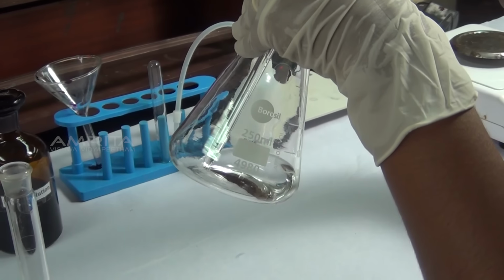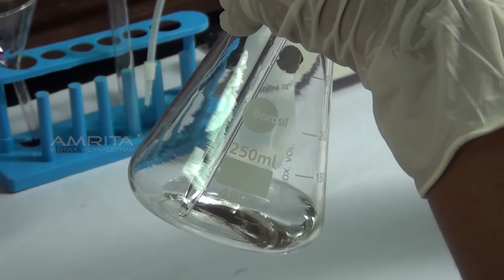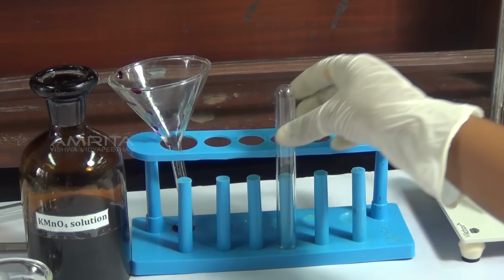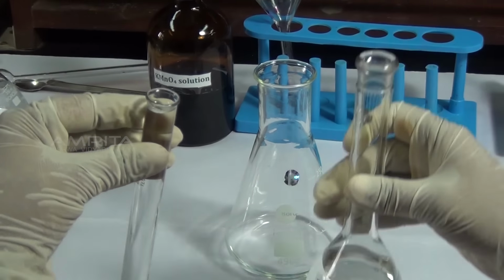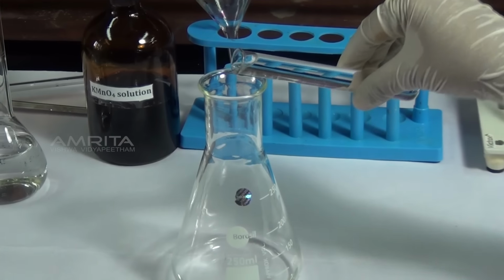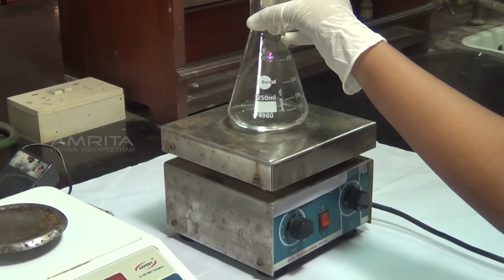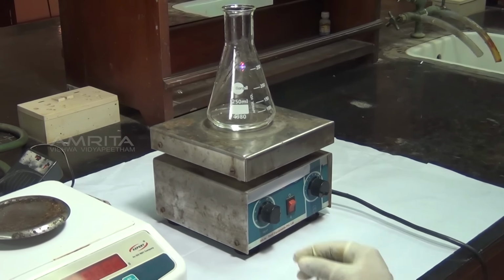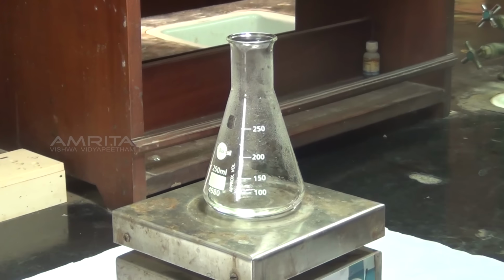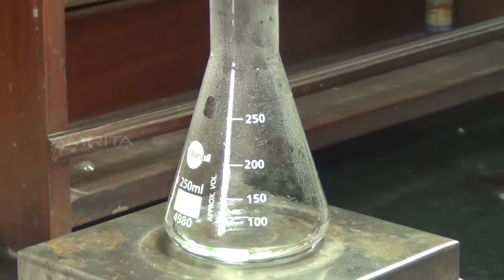Touch the tip of the pipette with the bottom of the conical flask to transfer the remaining solution from the pipette. Now add about 20 ml, which is the test tube full of dilute sulfuric acid, to the oxalic acid solution in the conical flask. Place the flask over the hot plate and heat the contents of the conical flask to 60 to 70 degrees Celsius as the reaction takes place at a higher temperature.